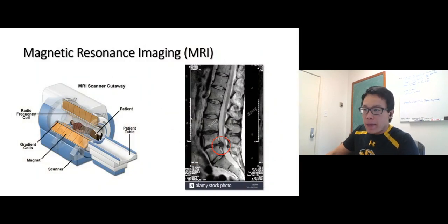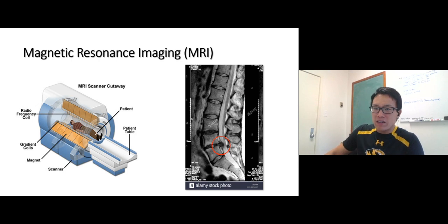Anyway, if we have any pre-med here or anyone who works in the medical field, you're familiar, and I hope so, with the MRI, magnetic resonance imaging. It's the same technique as the proton NMR, not the carbon NMR, but the proton NMR. Exactly the same technique. Because think about it, our body contains a lot of water, there's hydrogen, and contains a lot of organic compounds that have carbon and hydrogen. So we have a lot of protons in our body. So you can use the technique called proton NMR or MRI in the medical field to visualize, to show the image of some parts of our body.